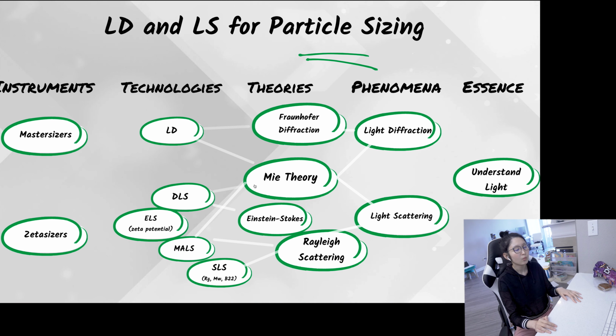And why is that? When we're measuring using DLS, we're still measuring a particle size that's large enough and has the angular dependence, we can utilize this angular dependence to better measure the particle size, to have a better resolution, I'd say.